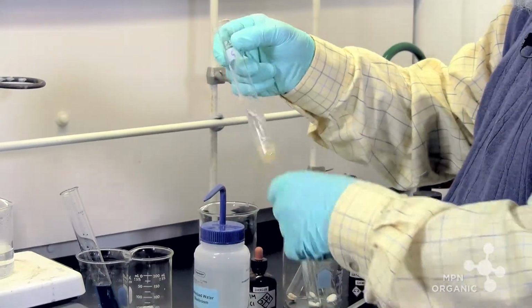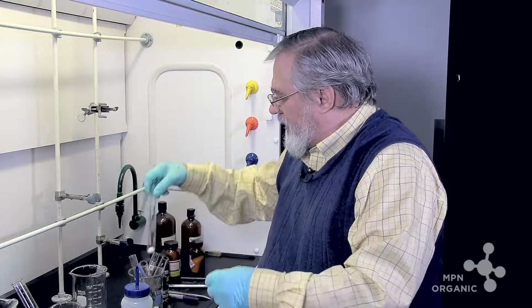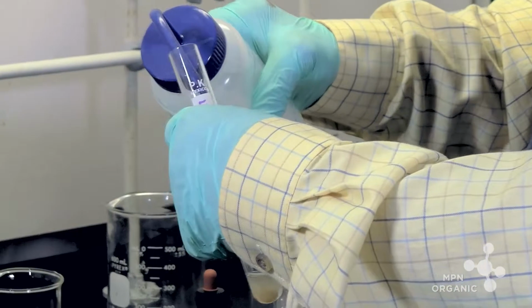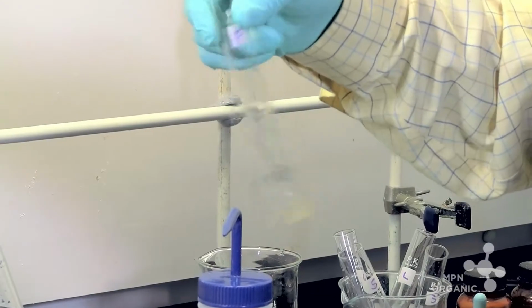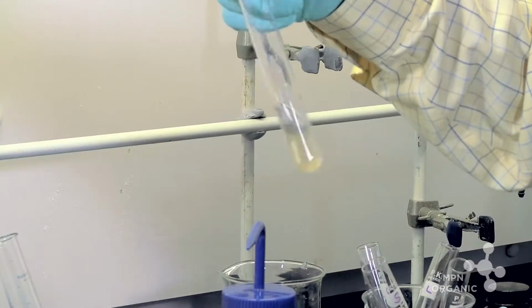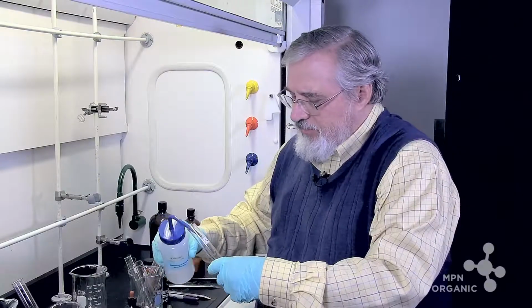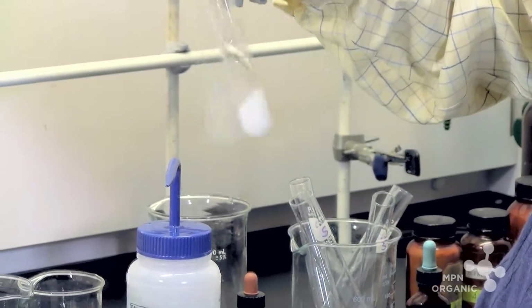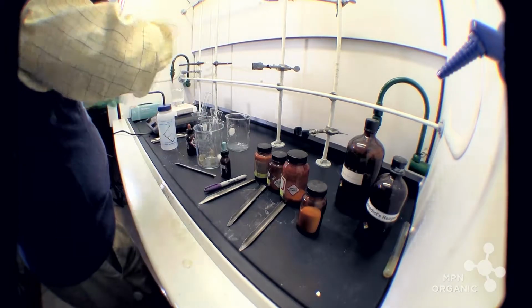These dissolve very readily. And then here's fructose. Now, fructose is not like these others in that it is a ketohexose. In other words, it has a ketone rather than an aldehyde. And then lactose. It's not quite as, I said, soluble. And then our 2 solutions of sucrose.